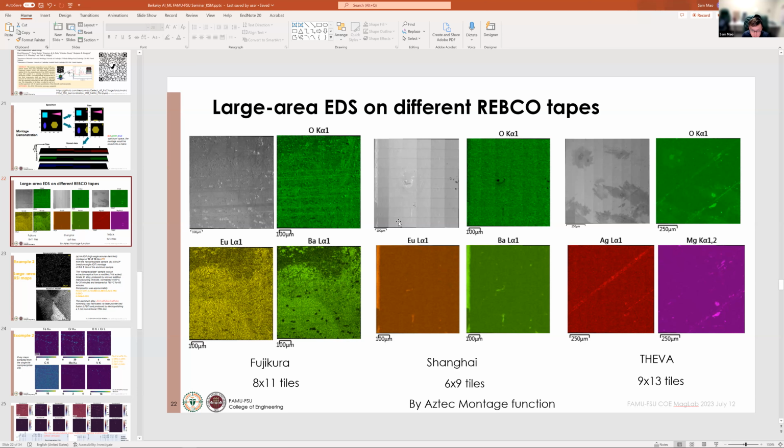I was looking at some code other people wrote, not for this but for bio samples, so they can control the column. Oxford has a version that tries to do auto brightness and contrast, but it won't work after a while, so you have to write a script to adjust that. Mostly what happens is the contrast is too high, which causes a problem.